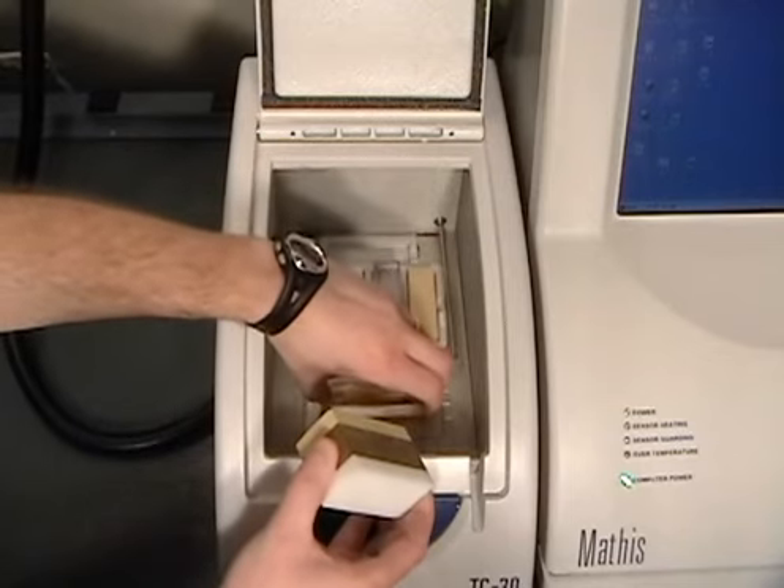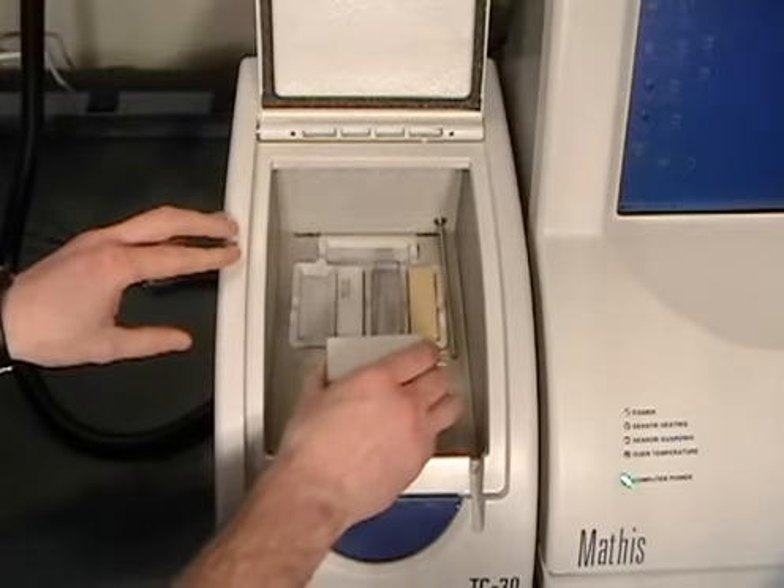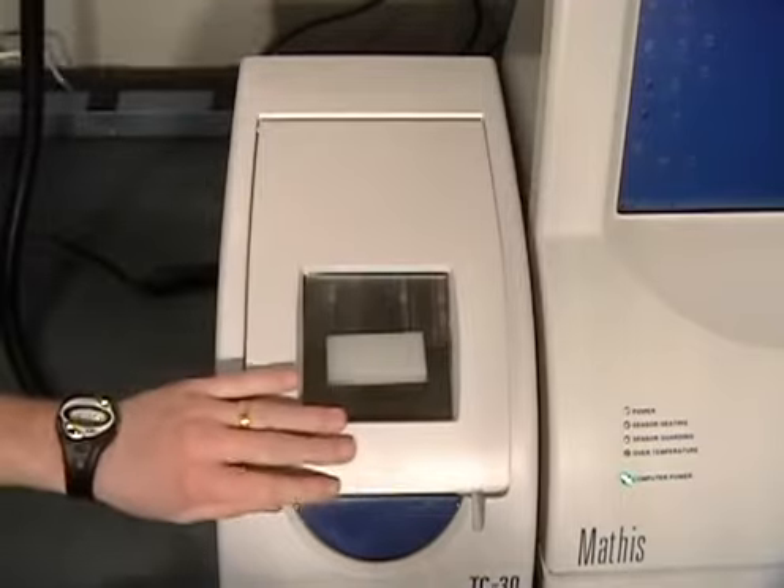The next step is to place Pyrex on top of the sensor with the weight on top and close the lid. Wait 5 minutes before initiating the first reference test.